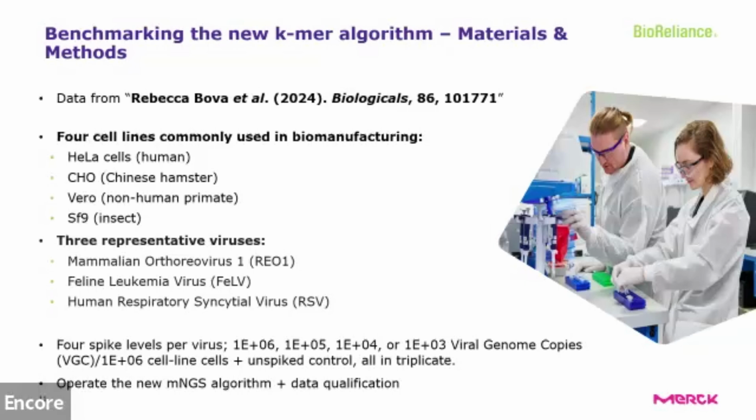And so we used the new k-mer algorithm, and we also do data qualification, where we look at all the positive hits in the context of the sample, and then see if it was actually a true hit or not.